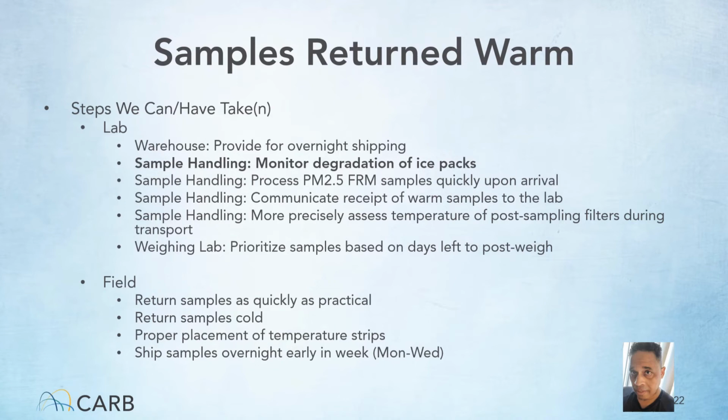And finally, it is very important that activated temperature strips not be placed onto a warm or hot surface. If possible, they should be placed either onto a cold surface, for example, a pre-refrigerated PM 2.5 canister, or just kept in the plastic Ziploc next to the COC. Also, please do not stick the temperature strips onto the COC.